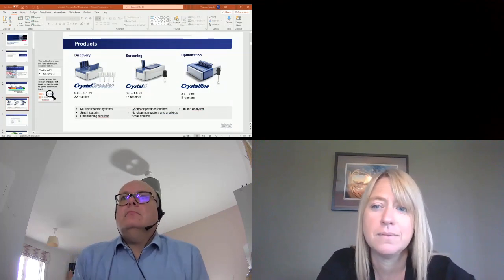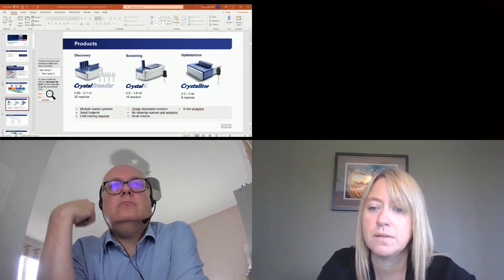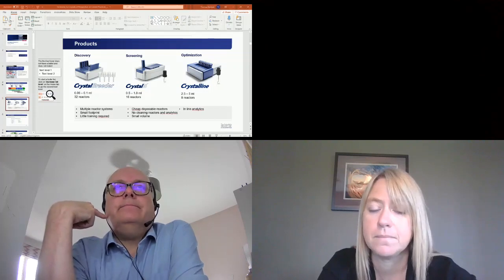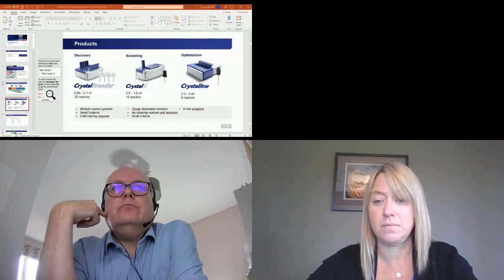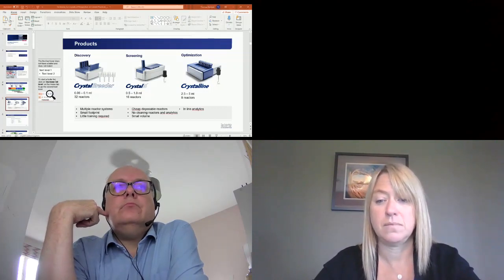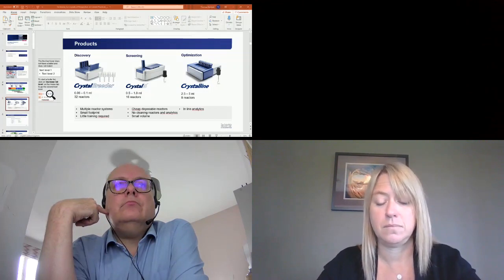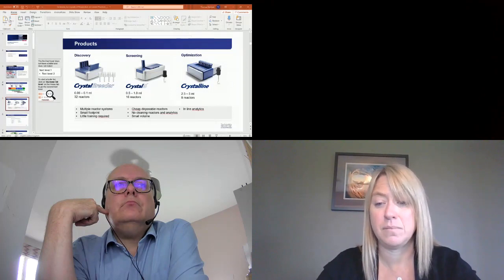Yeah, absolutely. We do get great translation. Obviously, the mixing dynamics change as you go up in scale. But for, say, solubility points, you're pretty spot on, even up to 1 liter scale. That's the benefit of having solubility, which is a thermodynamic property. It's translatable really well throughout the system.